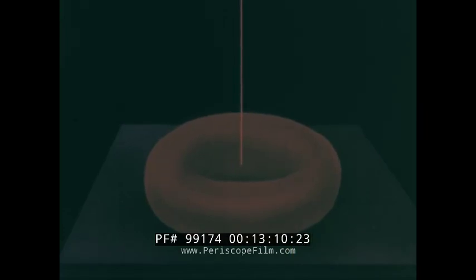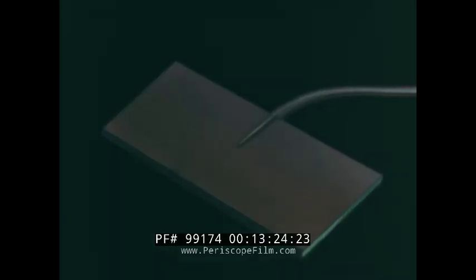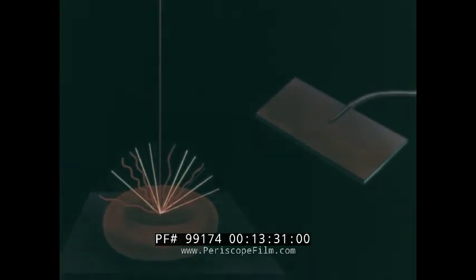At the point where the beam hits, the electrons excite the material of the specimen to produce many kinds of radiation, including visible light, infrared, X-rays, and streams of electrons. A suitable detector is used to measure one particular kind of radiation leaving any one point on the specimen at any one instant. One of the most useful kinds of radiation is called secondary electrons.